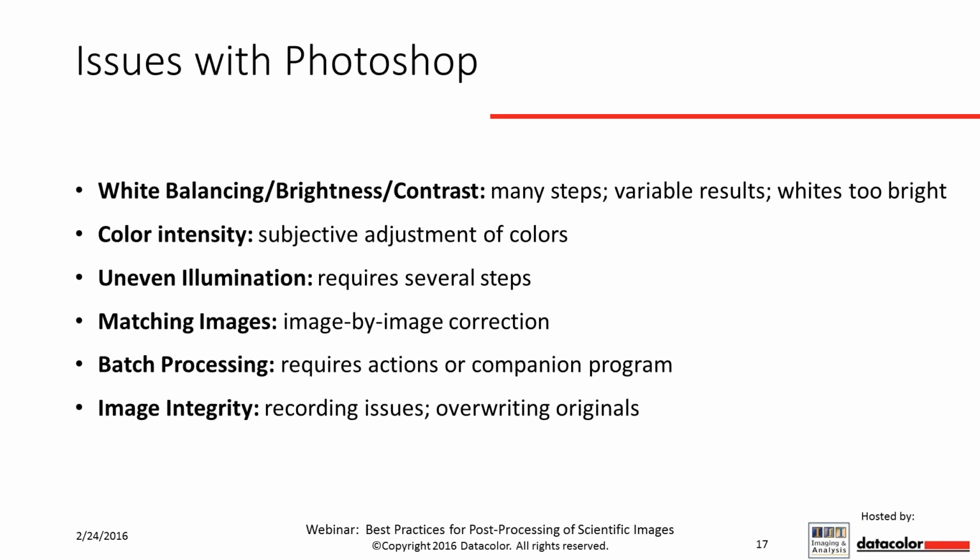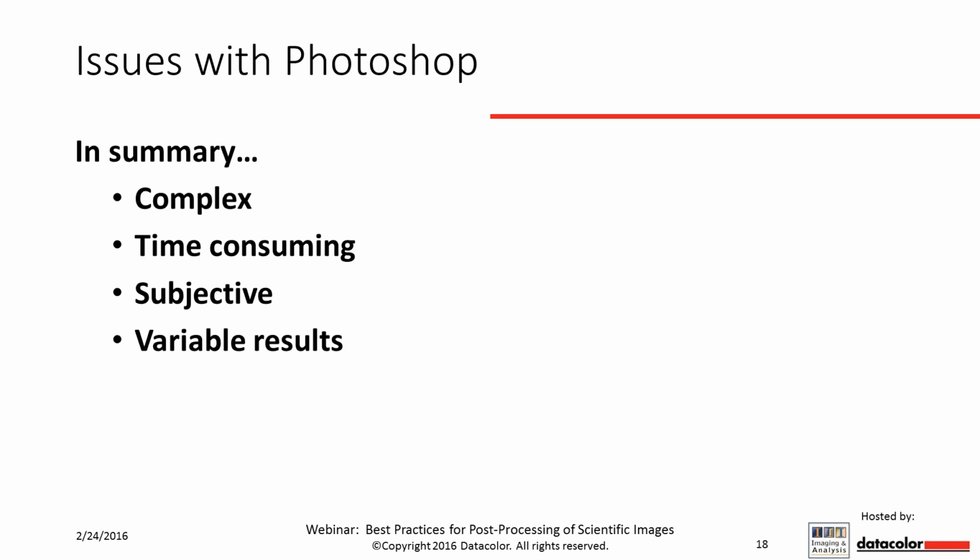I've been frustrated with other things as well, but I know that for users who are not as adept at using that program as I am, it's certainly a complex program, and it's a little difficult to figure out how to do things like batch processing when you're actually using the program. So really, it's a complex program. It's definitely time-consuming.